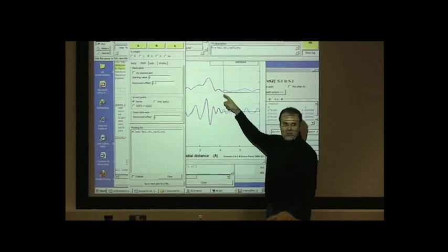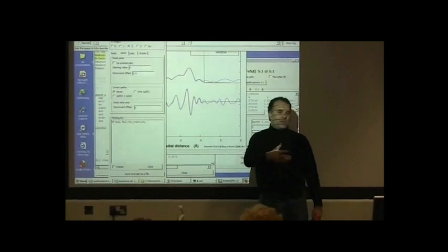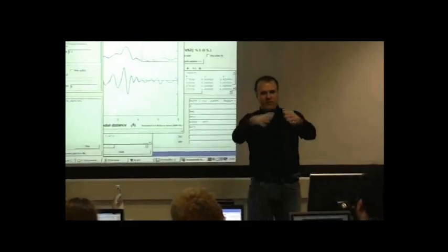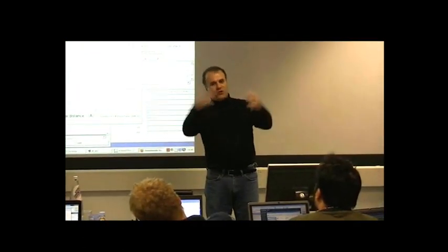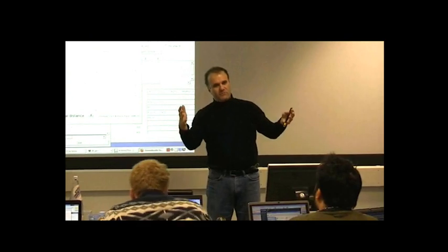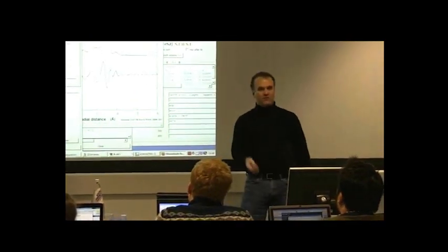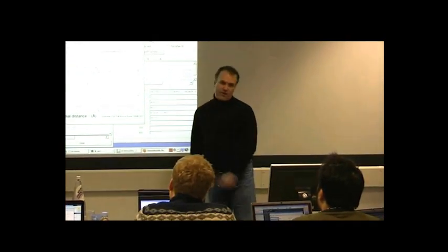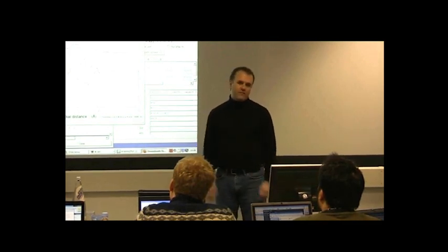So I tend not to worry about that too much. I just sort of do what I did. I see where most of the weight from the paths is, and make sure most of the weight of all of the paths is covered by the window. But I don't really worry very much about whether it's 4.2 or 4.3. It can't matter. If the fit is that sensitive, then you have some instability in the fitting model. And you should probably be including whatever stuff is out here.